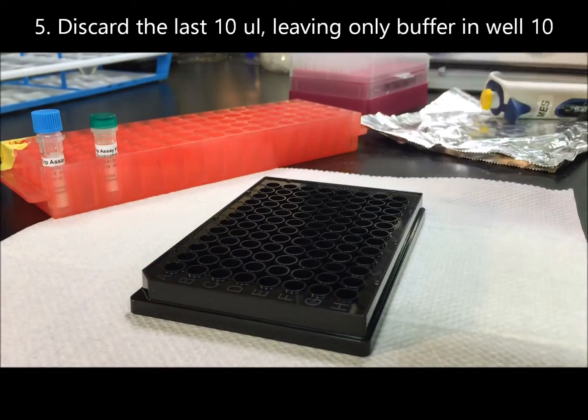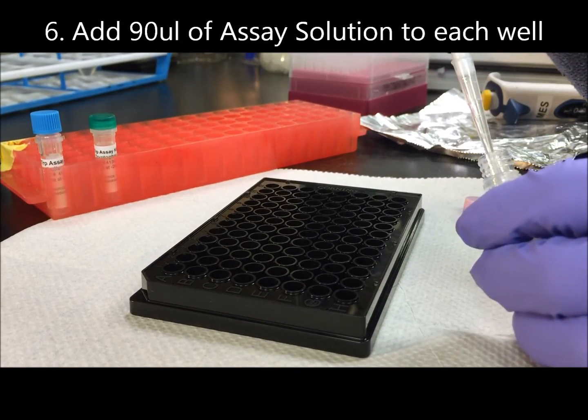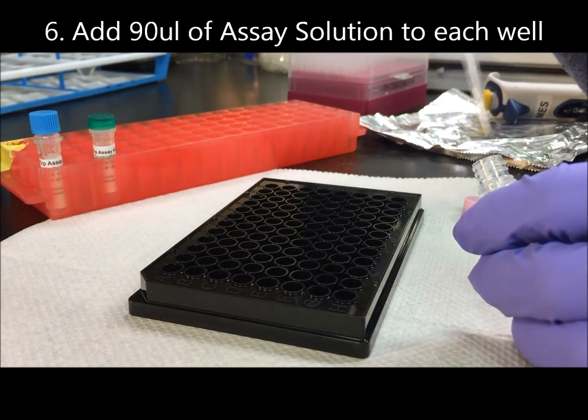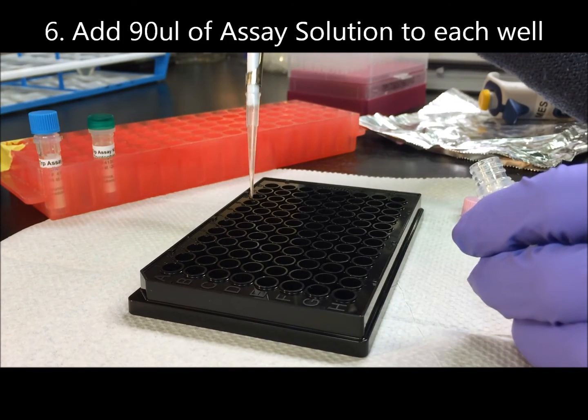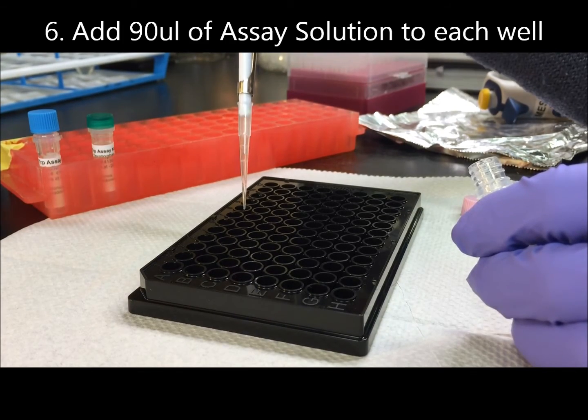After mixing in well 9, discard the last 10 microliters. Starting from the lowest concentration, add 90 microliters of assay solution to each well.